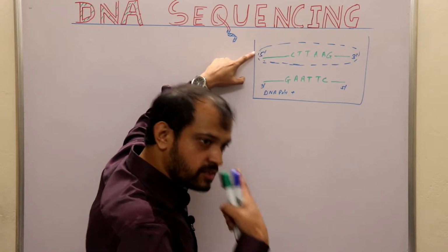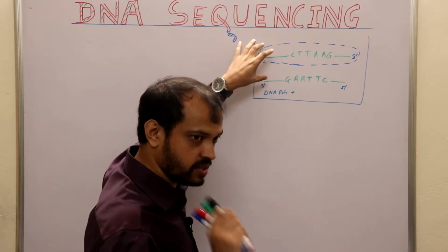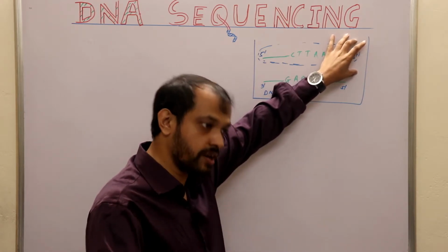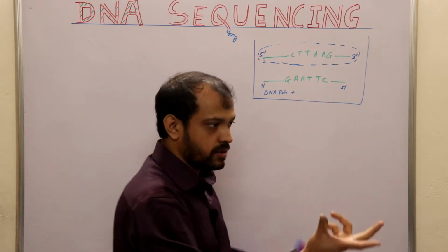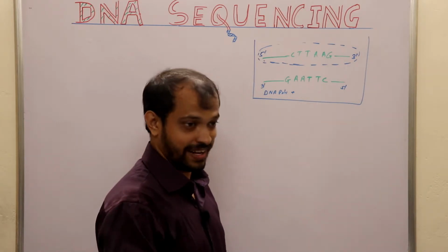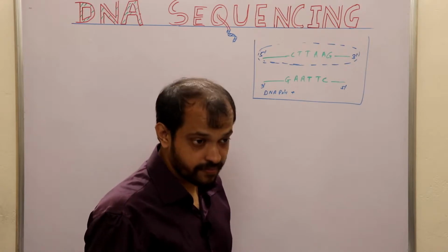They are using the same concept here. What you have just heard from me regarding Titanic, they are using the same concept here. Listen, what is that? We will just sequence one strand, then use a software or our own hand at least. This is just a 6 nucleotide long sequence, so we can guess it, right? If it is 600 long, yes, we can guess it. If it is 6,000 long, we can laboriously guess it. If it is 15,000 long, get out.